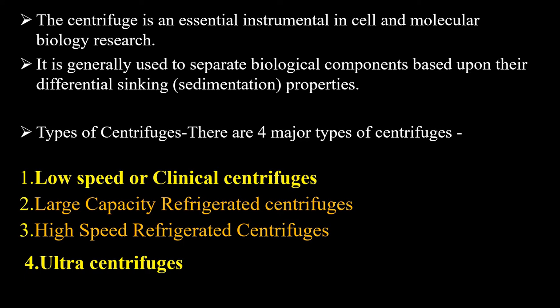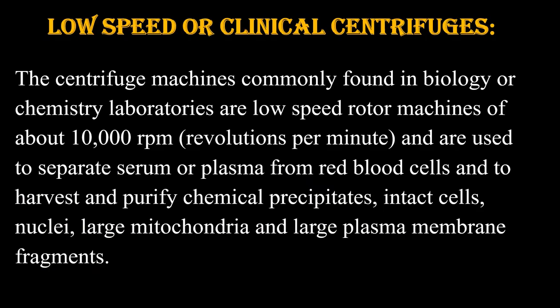Types of centrifuge. There are four major types of centrifuges. One, low speed or clinical centrifuges; then large capacity refrigerated centrifuge, high speed refrigerated centrifuge, and ultra-centrifuges, out of which only two, that is low speed or clinical centrifuge and ultra-centrifuge, are included in your syllabus.